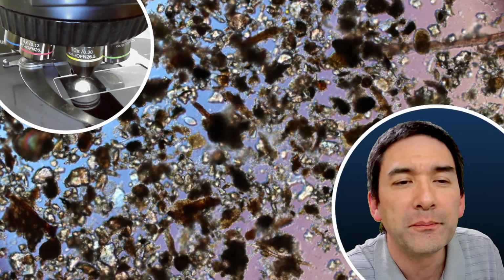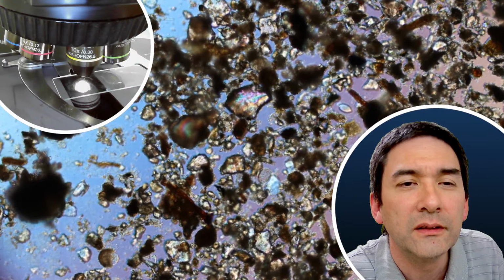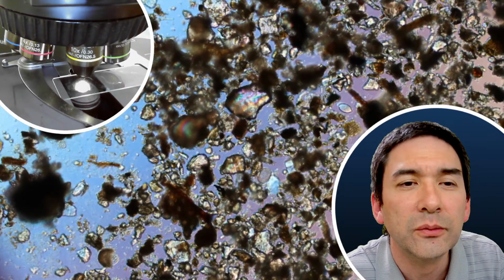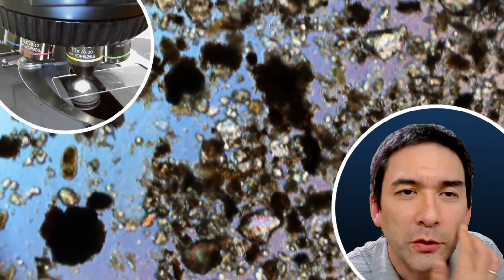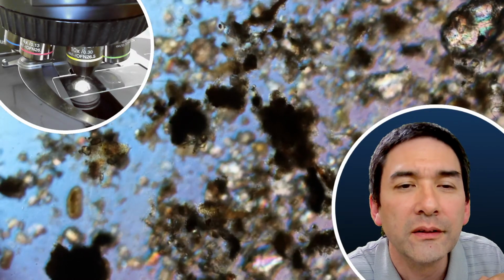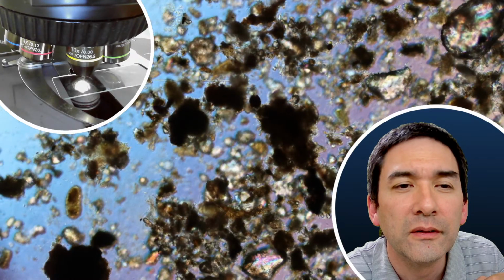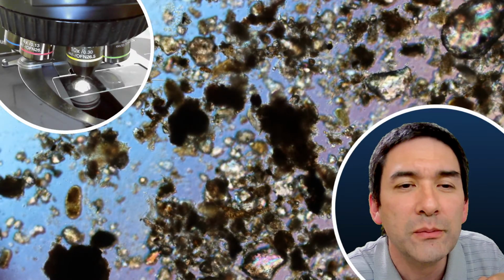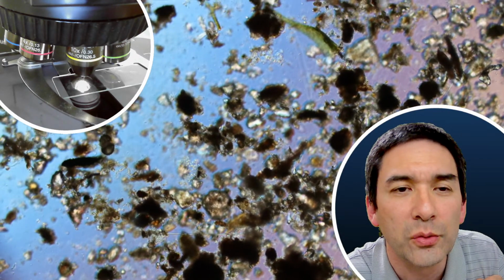Okay, lots of sand. Yeah, and refocus again. So again, it looks a little bit more like a rotifer and not like a tardigrade. And this one over here seems to be a ciliate, a single-celled ciliate. Ciliates are, of course, always single-celled.